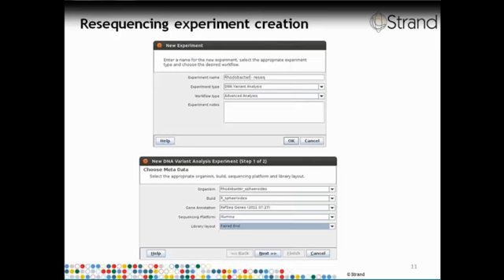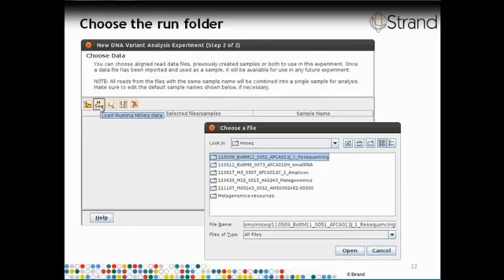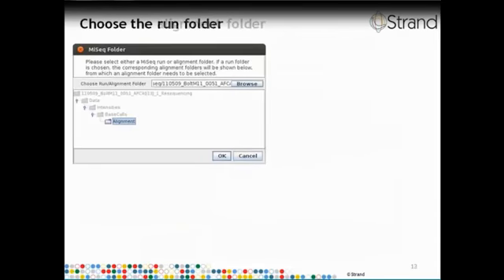The navigator on the left out here shows all the information which has been loaded. We have the reads, and the indel and SNP results have also been loaded into the navigator. The center panel of the tool shows the Genome Browser. By default, the first chromosome is shown, and we can see that the depth is uniformly high across the entire chromosome. The workflow on the right shows all the different QC and analysis steps that can be carried out on DNA data. So now that the results of MiSeq have been loaded into the tool, let us take a look at how the import was carried out.